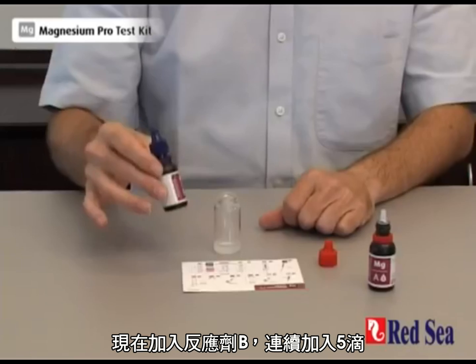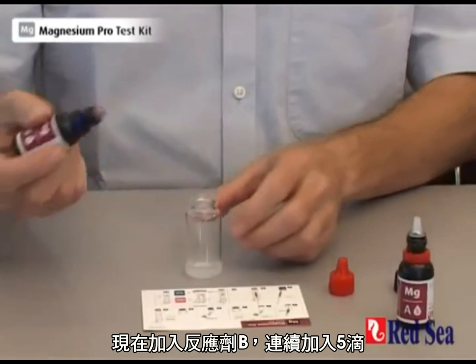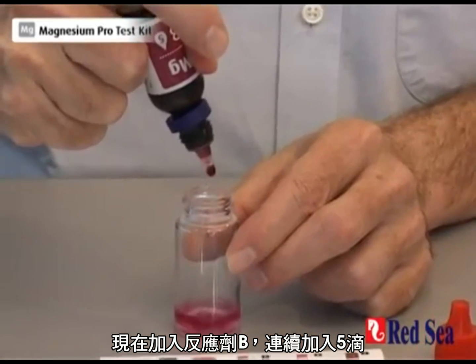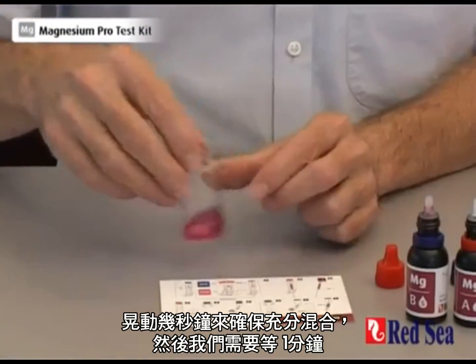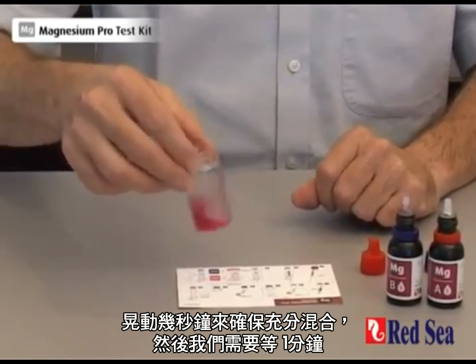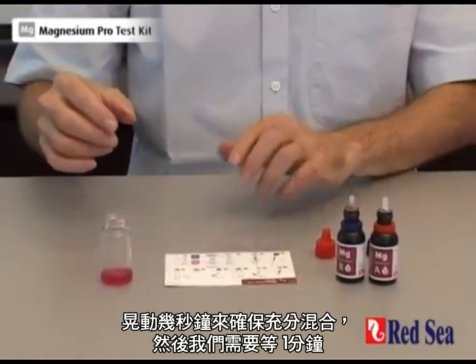We're now going to add reagent B. We have to add five drops and they go in one after each other: one, two, three, four, five. We now shake for a few seconds just to make sure it's properly mixed. We now leave this on one side and we wait for 60 seconds.